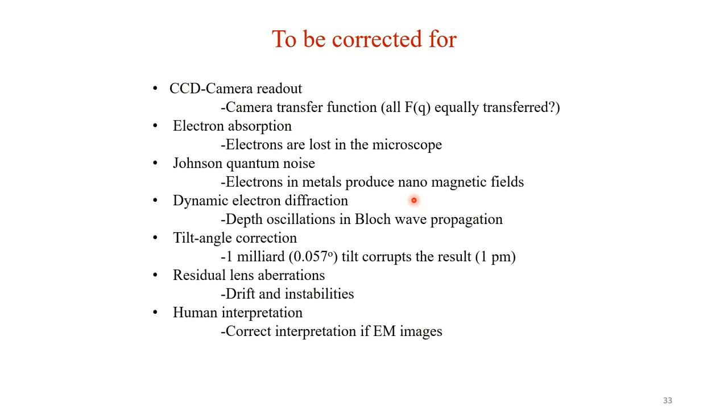through their path. For example, you have a 10 centimeter metal tube, and the velocity of the electron is 230,000 kilometers per second, then it takes 500 picoseconds to pass through that 10 centimeter long tube. While doing so, the electrons from the beam just see snapshots of those magnetic fields. So you don't have a sufficiently long tube to average this deflection or distortion in the beam path. So this quantum noise is very difficult to correct for.